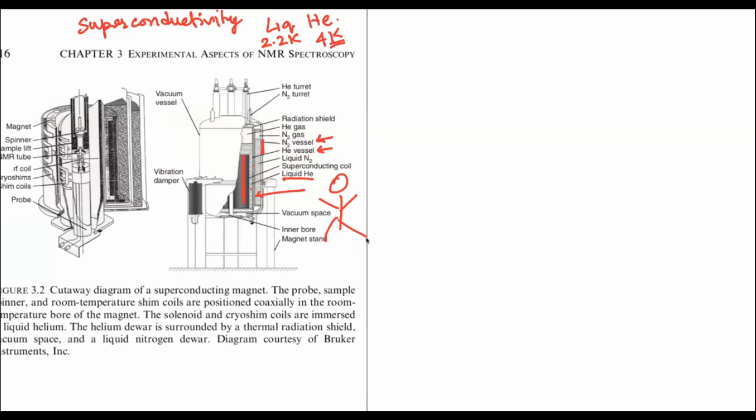And of course, you have a shield outside, where we will be standing and doing our experiments. Nowadays, these shields are designed so that the magnetic field does not affect the person standing nearby. Generally they look for something called a five Gauss line, and nowadays it's very close to the magnet, so we don't have to worry. But if you're looking at older magnets, or going for an MRI scan, you have to be very careful. You should carry nothing that's magnetic.